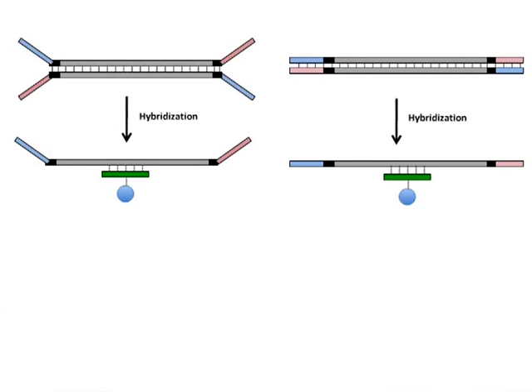One of the key things for hybridization-based selection of regions of the genome is how the library is prepared, and more importantly, how the library is blocked. This is a basic cartoon, made intentionally basic, to represent whether you're using Agilent or Nimblegen. The concepts are quite universal, where you use a hybridization-based solution to target a subregion of the genome.